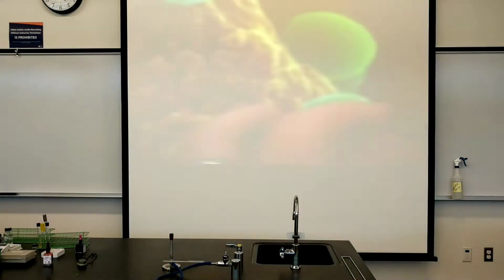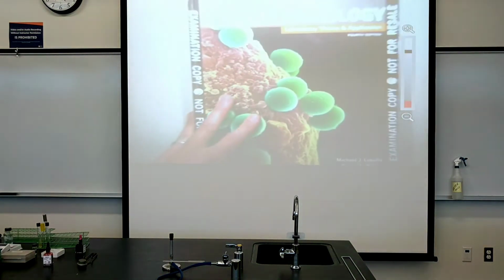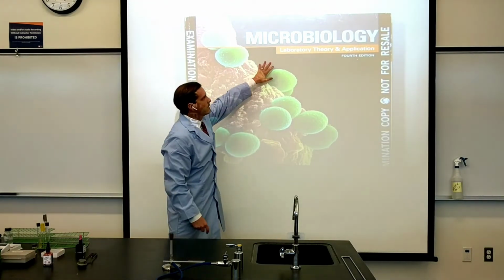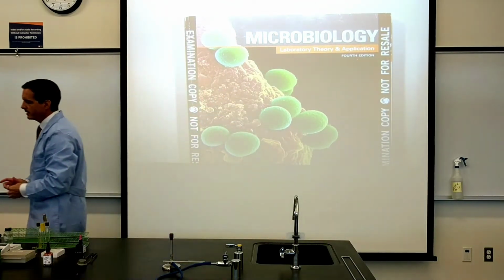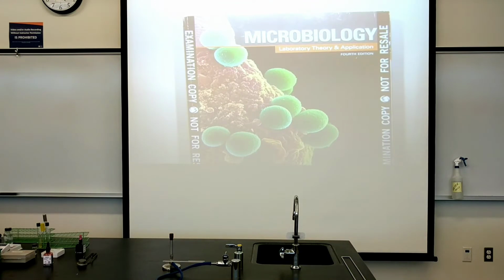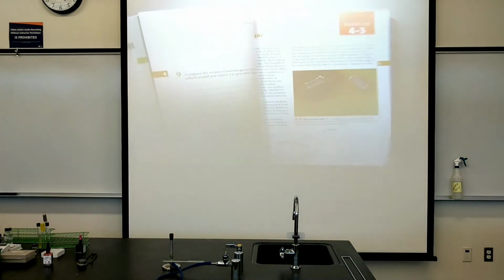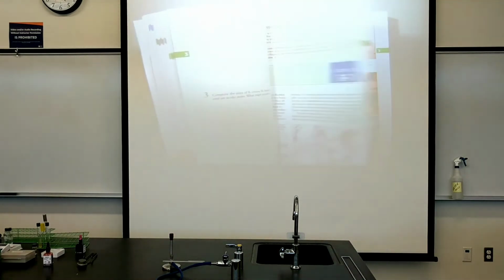Okay, so this is the lab manual. It's entitled Microbiology, Laboratory Theory and Application by Leboffe and Pierce. This happens to be the 4th edition, but a 3rd edition will work a-okay. There may just be a little bit of a difference in numbering.